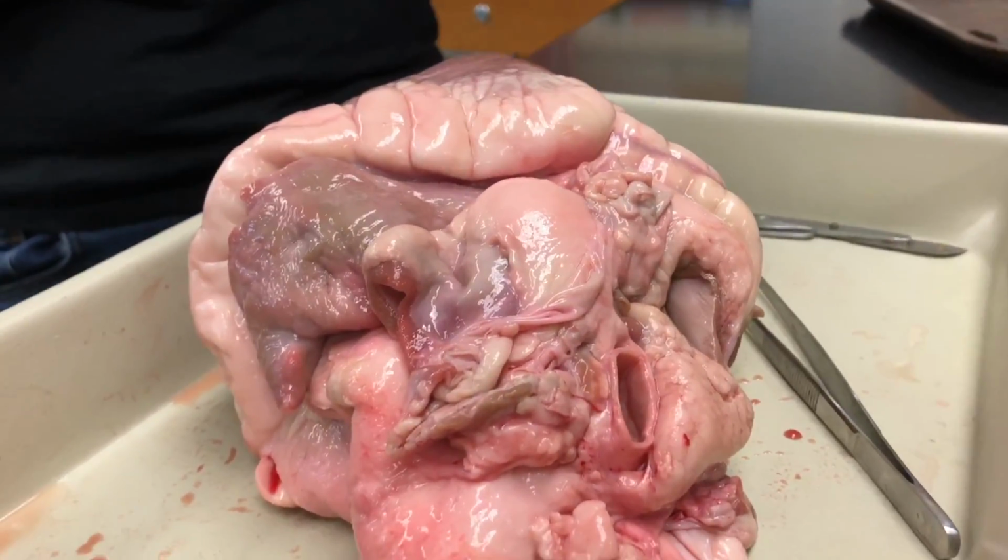These vessels do not contain valves to control blood flow. No, the other way. Oh my God. These valves do not contain vessels. All right. Hey, we're learning. All right, guys, we're learning.